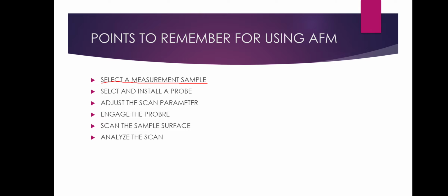If the velocity is correct, then the lifespan of the tip increases, and we get improved surface tracking, but at the expense of scan time. The scan time gets increased, but we might get a proper reading as well as proper surface tracking.